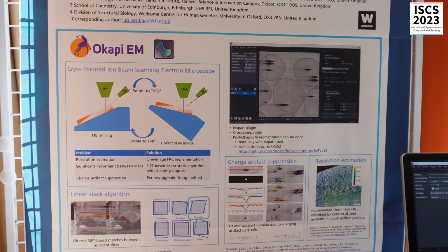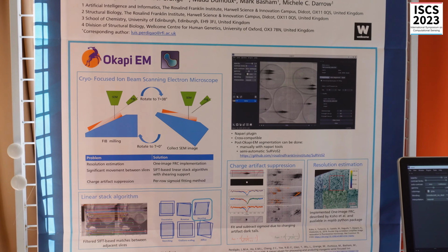And I'm here to present a demo of two pieces of software that we have developed, me and my colleagues, Neville as well. One of the software is called Okapi-EM and the other Redlionfish. They were developed to process biological imaging data.